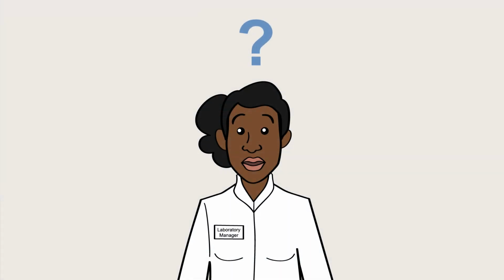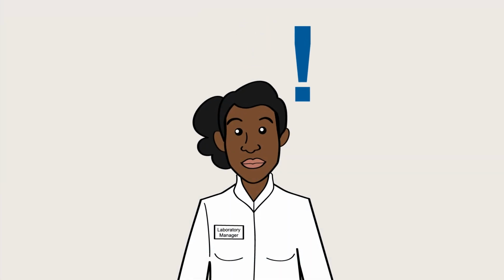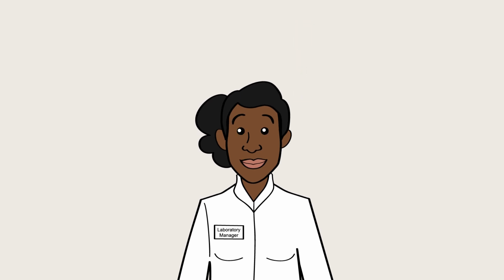If you have any questions, review this tutorial again or read the user instructions. You may also contact your supervisor or the SORMAS support team.